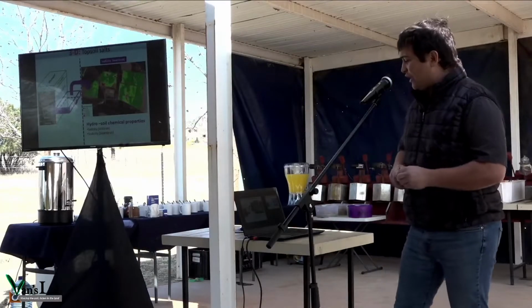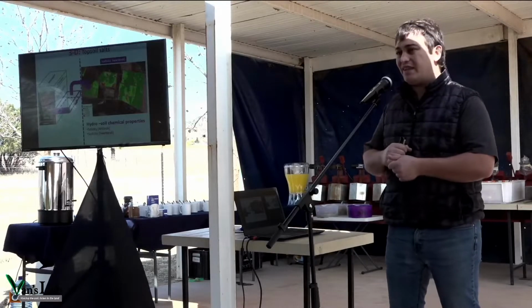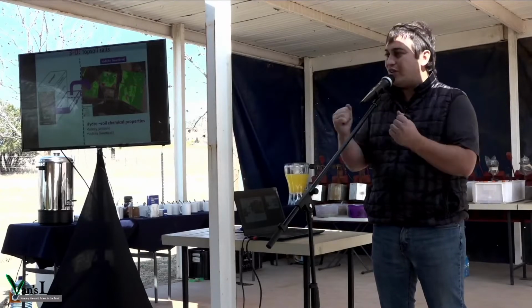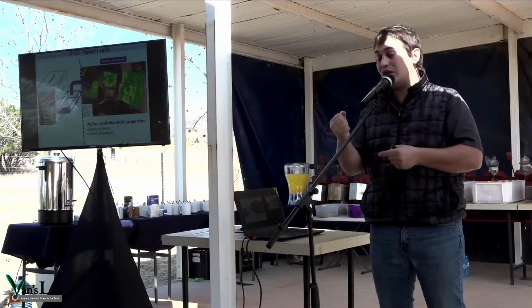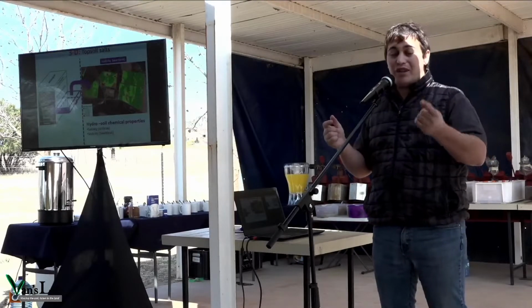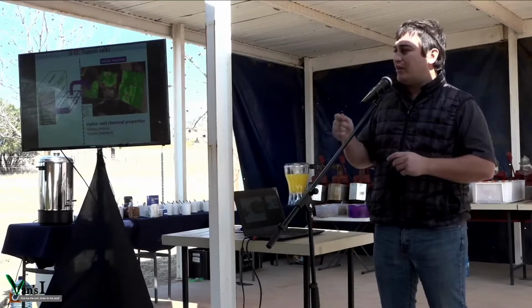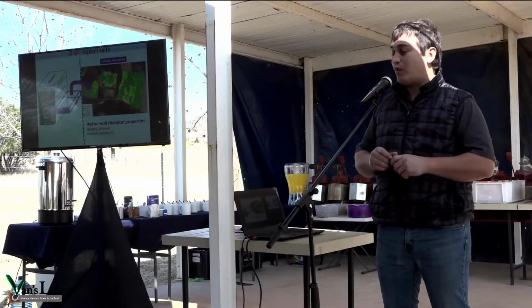All right, but salts, so sodicity is really the guy that buggers up your structure. What that does, it causes your clay particles to disperse. It goes into suspension, and it washes into those pores and it blocks those pores. So if you have a lot of dispersion, and that's one of the product testing stuff that Lindy spoke about, Leon developed a method to really go and look at your level of dispersion in your soils at that stage in your field. All right, what is your dispersion?